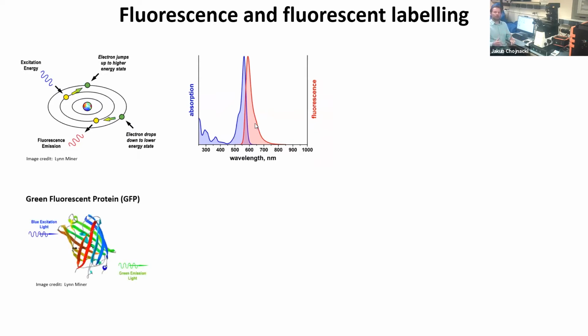So, what are some molecules that we use as scientists for fluorescence microscopy? We use several different molecules which exhibit this fluorescent behavior. One of them is the so-called classical green fluorescent protein. This is a green fluorescent protein which, when excited with a blue excitation light, will give you a green emission light. And actually, in the samples that I'm going to show you later today, I have a virus that is labeled with a green fluorescent protein.